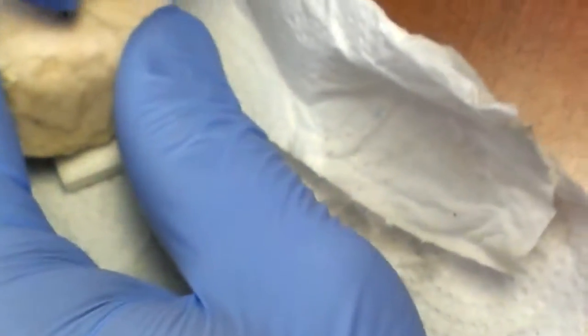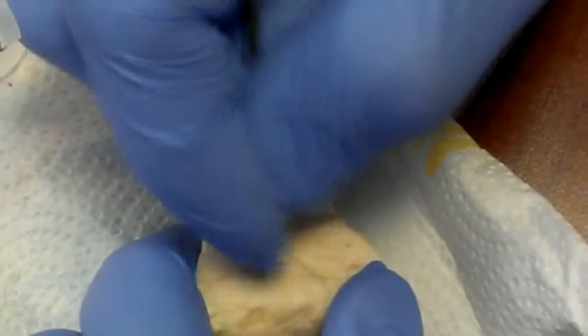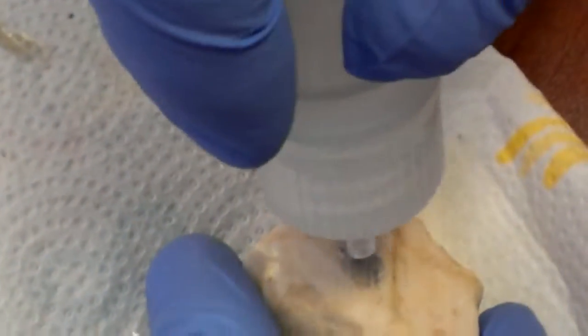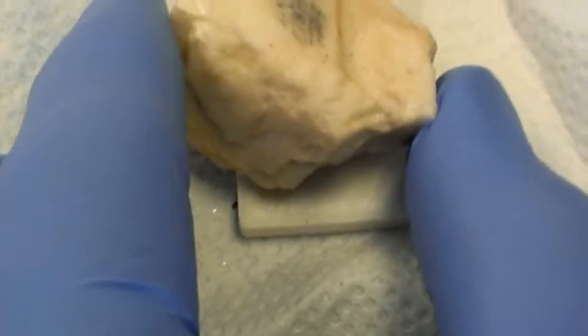So what if we got powder? Let's grab some of the powder. Why don't you try some of these little, like this. Seeing how much of that is going to be the iron that's going to react. Let's see. Very light fizzing, that's about it.